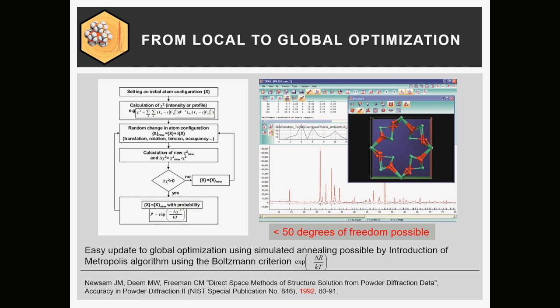It's like if you have molten metal, and the metal, if it's very hot, the atoms go in all kinds of directions, and when you cool it down, they will start shaking only a little bit, and if it's completely cooled down, it stops. And the same idea. The only problem is there's no guarantee that you find the solution. You will find the solution if you do this an infinite amount of times, and if you find the correct solution multiple times. But in general, we have chemical knowledge. We can look at structures. We can see if the structure makes chemical sense. So we get the feeling if it's probably right. There's no 100% guarantee, but it works actually pretty well.